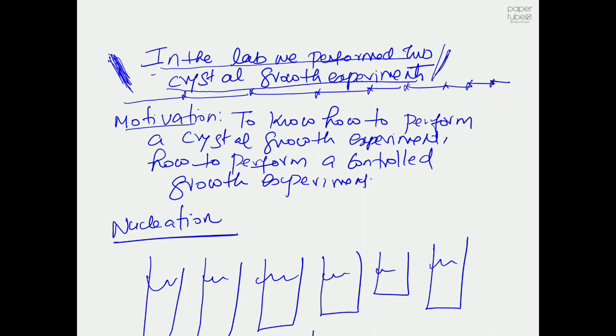Apart from that, from the crystallization side, you must know how to perform a crystal growth experiment, and not just a crystal growth experiment. You should know how to perform a controlled crystal growth experiment. And I already said why we need to perform a controlled crystal growth experiment. There are so many good reasons I already explained.